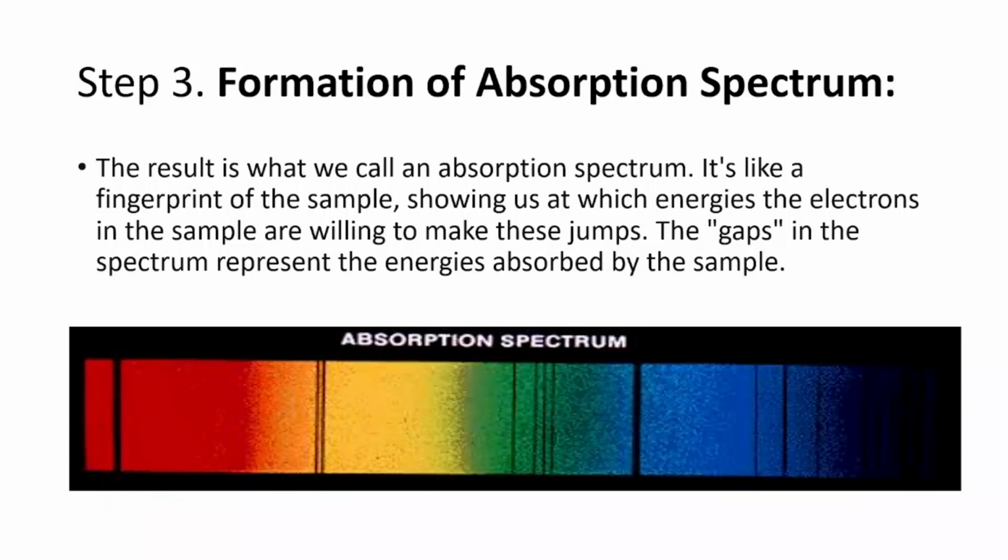All right. So in a situation where, as I said earlier on, your supervisor gave you a plain solution that you don't know what is within it or what it contains, when you run the spec and you get a spectrum like this, it will be able to give you an insight of what that particular sample contains or what the sample is made up of. So this is just a beginning of it. When you get this spectrum, in addition to other useful information or data, you'll be able to characterize completely the solution that your supervisor gave you. Now let's continue the reading.